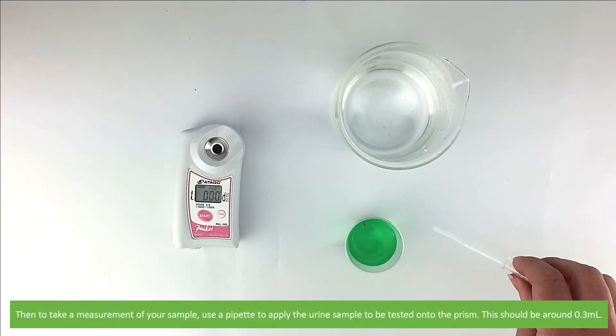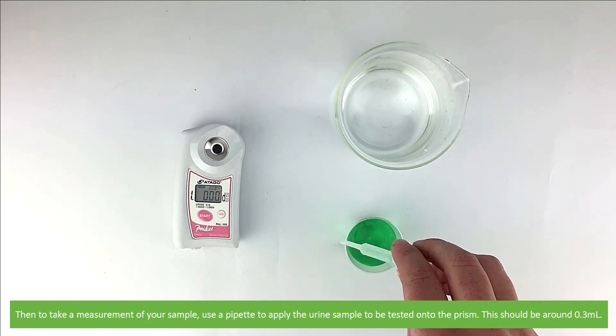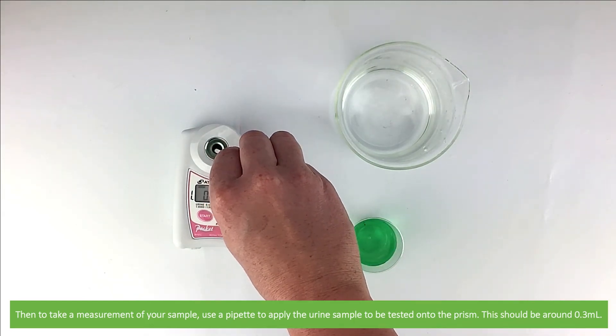Then, to take a measurement of your sample, use a pipette to apply the urine sample to be tested onto the prism. This should be somewhere around 0.3 mils.